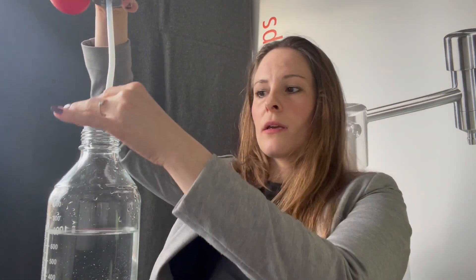Here you see the Solvent Pump Mini representing the whole family of our solvent pumps. The pumps are fixed on the container carefully and tight. The connection must be airtight because otherwise it is not possible to create the pressure in the container and the pump would not work.